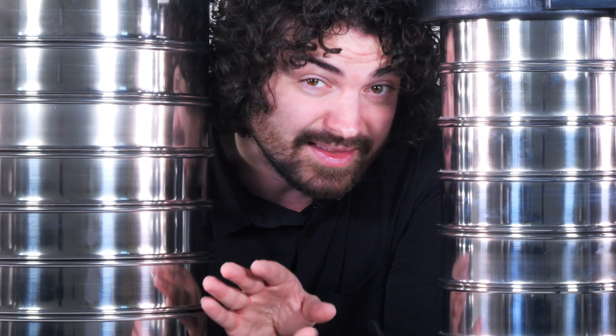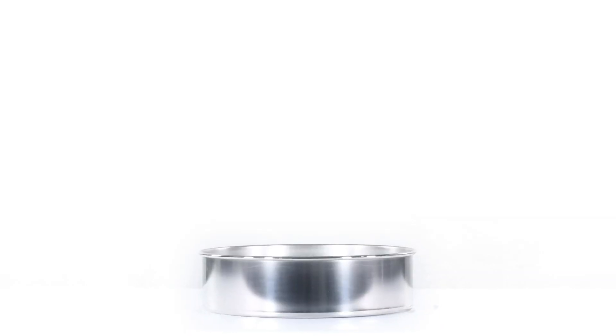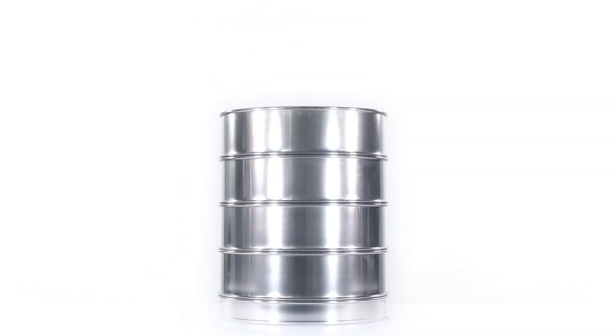The RX30 is exactly the same as the RX29 except it uses 12-inch test sieves. You can only fit 4 full height sieves with a full height pan, but if you use a half height pan you can use 6 full height sieves. If everything's half height, then you can fit 8 12-inch test sieves.